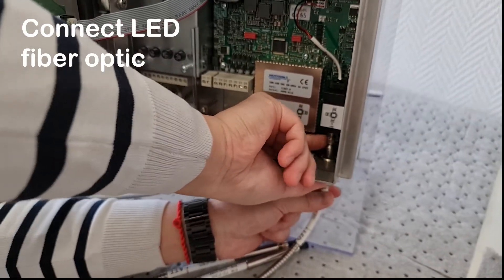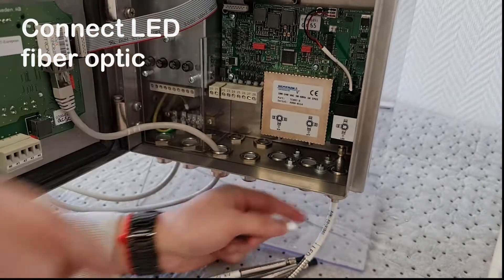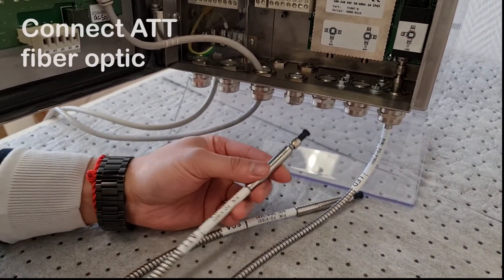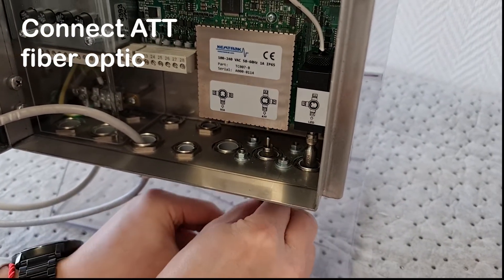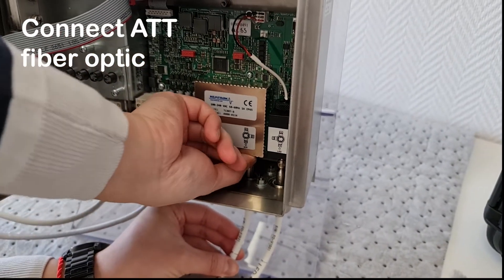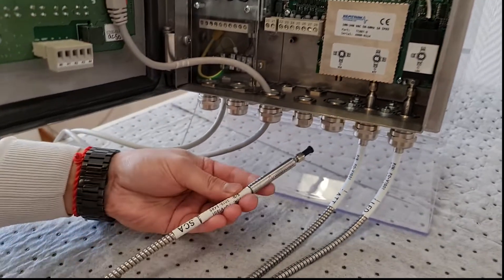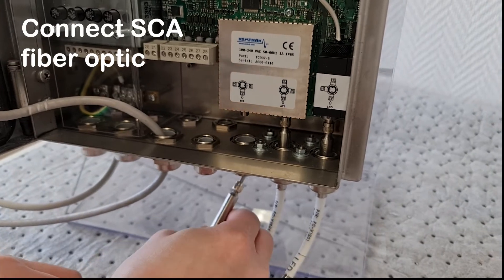The fiber optic marked LED is connected to the LED housing. The fiber optic marked ATT is connected to the attenuated light detector. The fiber optic marked SCA is connected to the scattered light detector.